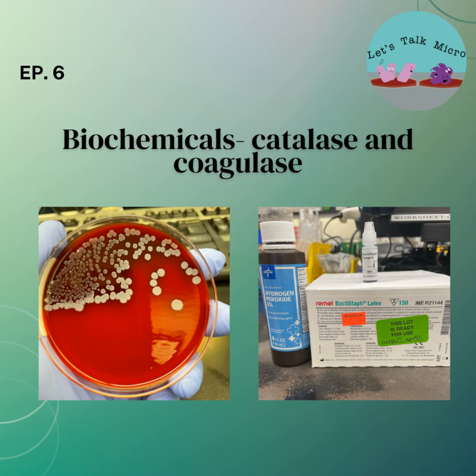So for you students out there, take advantage of all the technology we have. I see students with tablets. Take pictures. Take pictures of your plates. That way, when you're studying, you start seeing those images, and you're like, okay. So you start correlating that image to the organism. Because they have staph and strep, they have different morphologies. Your staph tend to be large colonies. They're flat, whereas strep are smaller. They're raised.